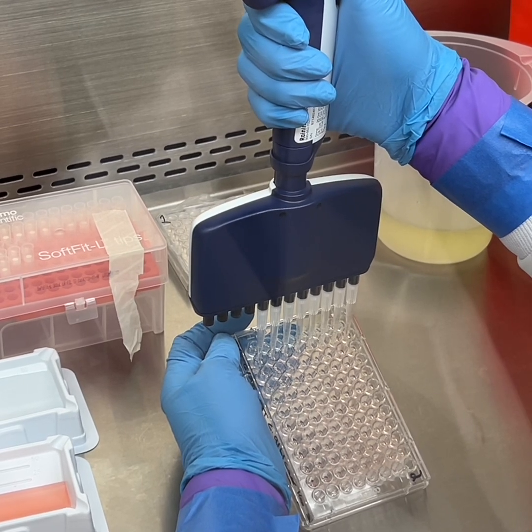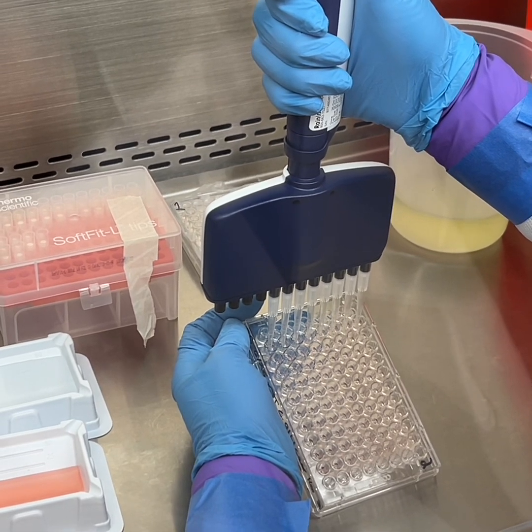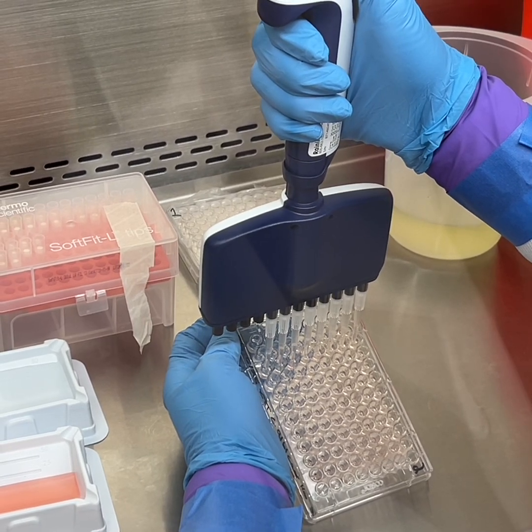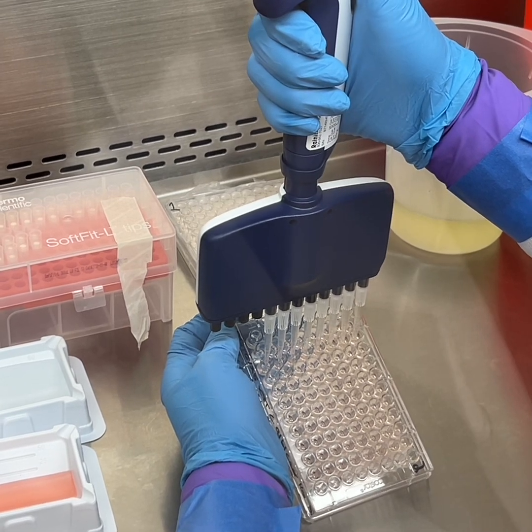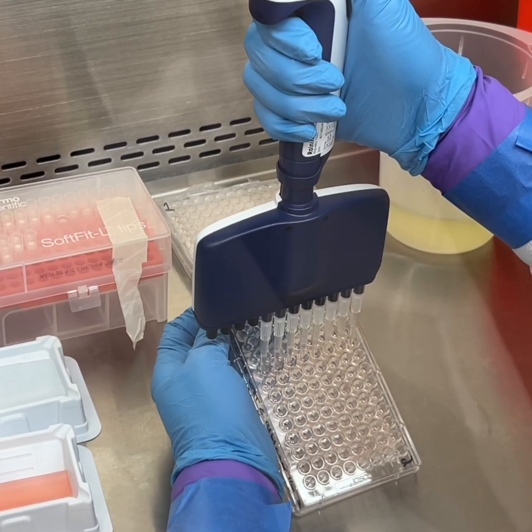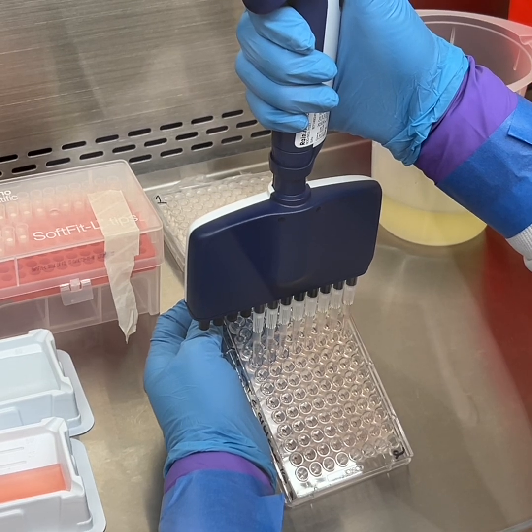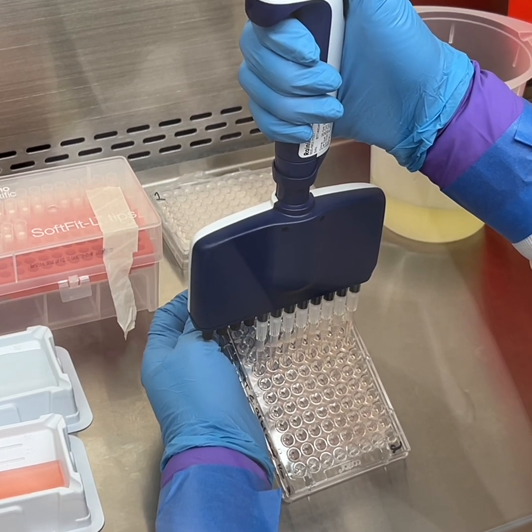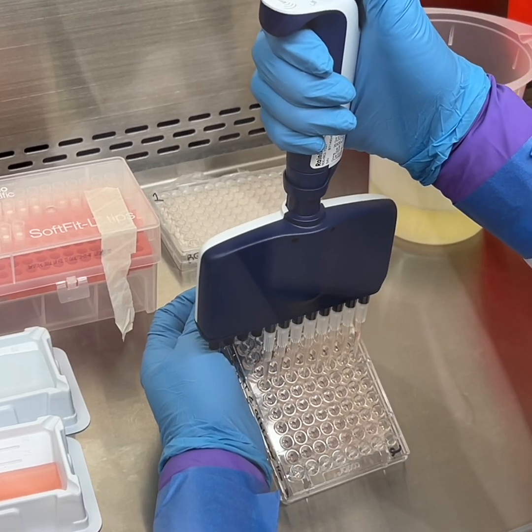1, 2, 3, 4, 5, 6, 7. That was a 1 to 2 dilution. Again, 1, 2, 3, 4, 5, 6, 7. It's another 1 to 2 dilution. 1, 2, 3, 4, 5, 6, 7. So I'm touching the same corners of each well.